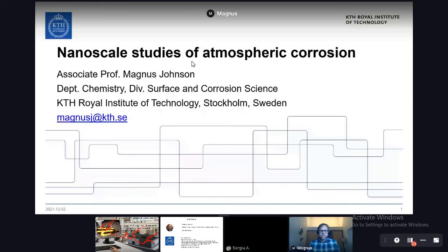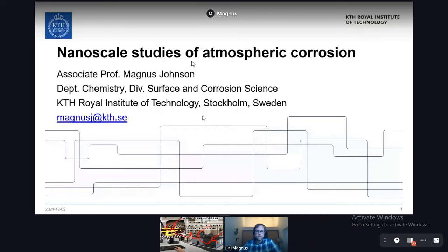So thank you very much, Sergio, for letting me present our latest data on nanoscale studies of atmospheric corrosion. In my lab, we use nano-FTIR spectroscopy in a number of different fields, for example, in studies of nanocellulose and plant cell walls. But today I want to focus on the atmospheric corrosion of copper surfaces and how we can benefit from the new laser that Sergio has introduced today. If you have any questions to me later on, you can just send me a mail to magnusj@kth.se.